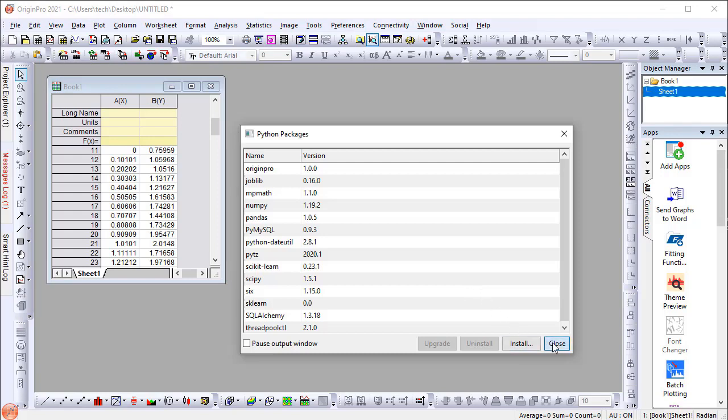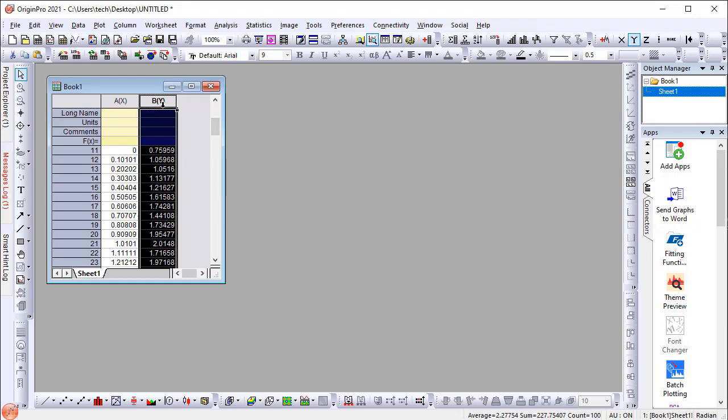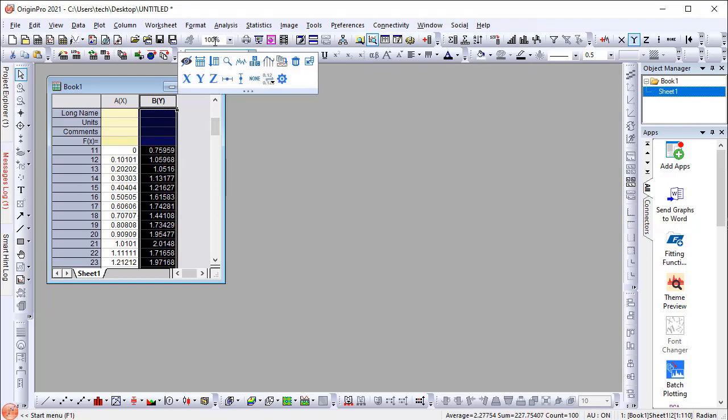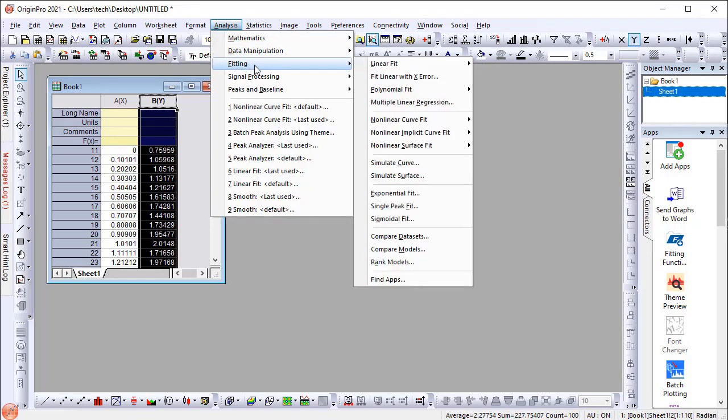Now let's fit our data with this function. With the worksheet selected, launch the Non-Linear Curve Fit dialog from the menu.